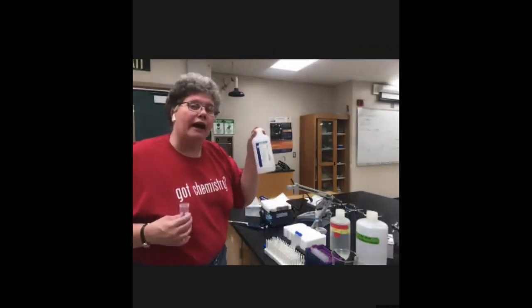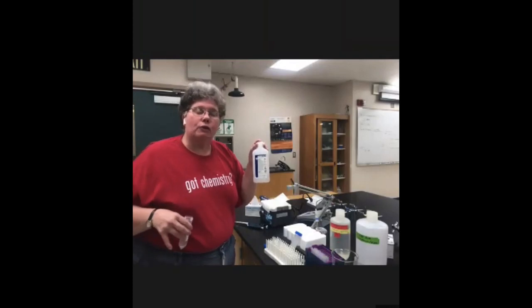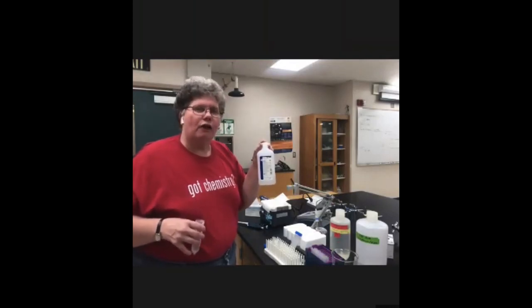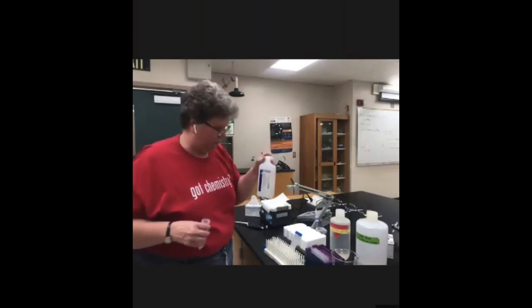Do not ever drink pure 100% ethanol. It will burn your throat as it goes down. I know college students are very fond of getting as much alcohol as they can in their systems, unfortunately, sometimes, but this is not something you ever want to drink.